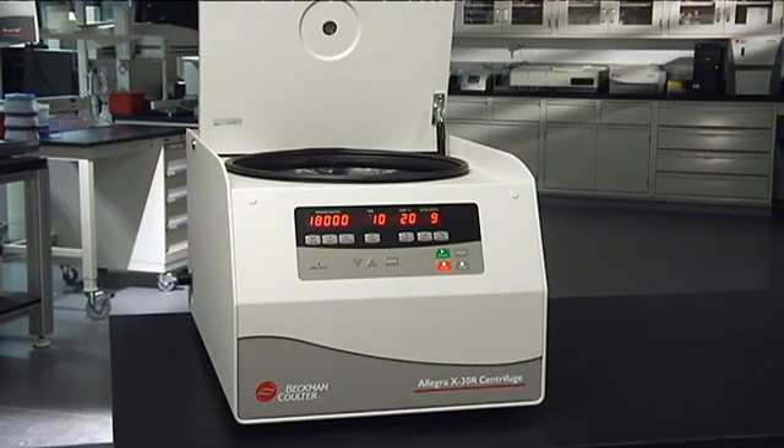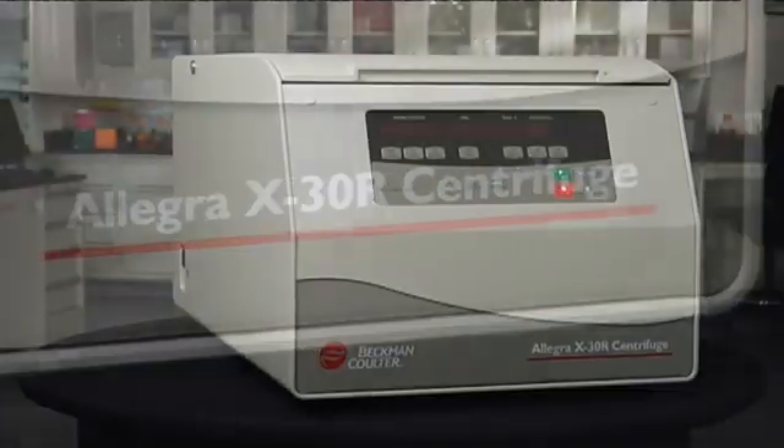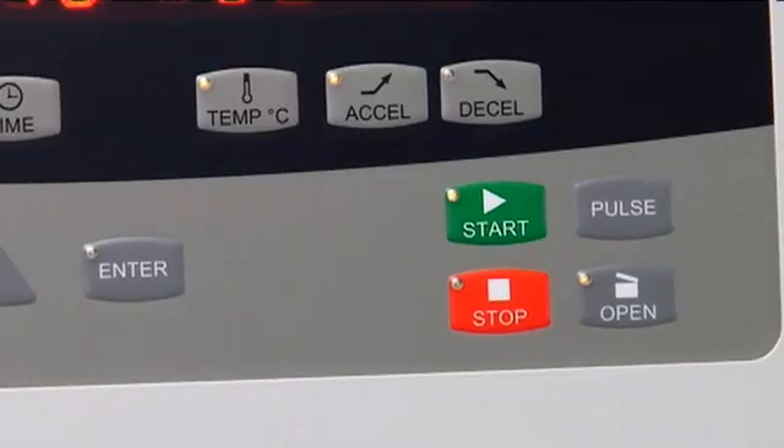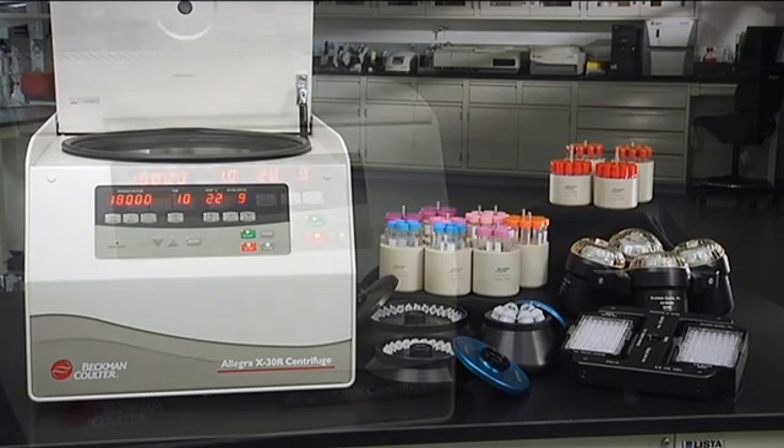Because your work revolves around the lab, but our business revolves around you. The Allegra X30 Series: improved performance, compact size, enhanced applications, a better experience.